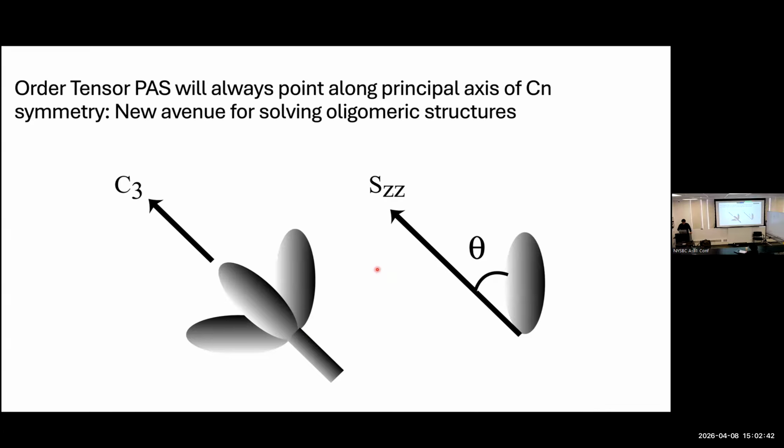Now you might say, oh, it has to be the symmetry axis, right? Because it feels good. Makes sense. And one way to think about it is if you pick any other angle, let's say this orientation, we'd run into trouble because there's another equivalent direction here, another equivalent direction there, and there must be a uniquely specified alignment tensor, and those would average out anyway. So when it comes to oligomers, the alignment is predetermined by the symmetry of the oligomer. That can be quite simplified.